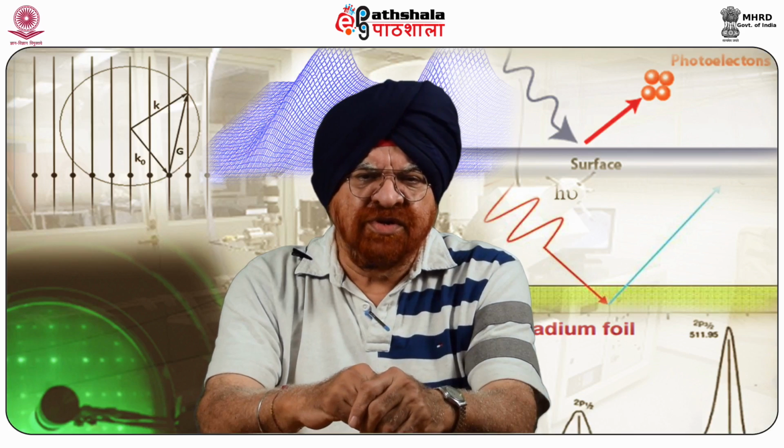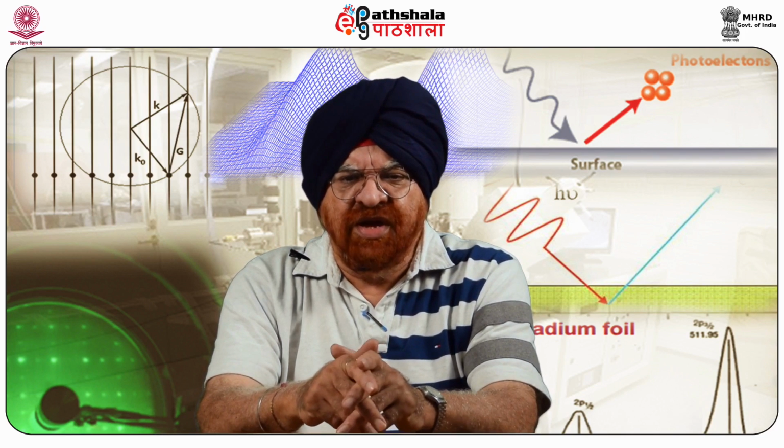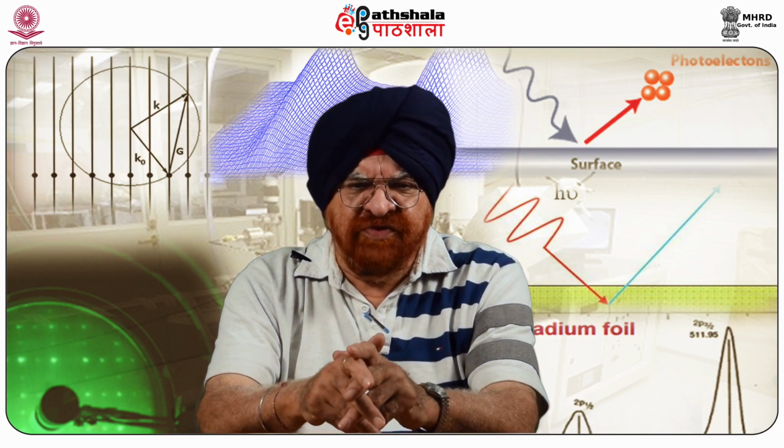Now, the next question that comes to one's mind is why ESCA? Why should we study this? What is the importance of this? When we do this study, we can have elemental identification and quantification of any element from lithium to uranium. That means from a very light element like lithium with a very low mass number of 3 to uranium, which is 92, a very heavy element, we can utilize this very effectively.